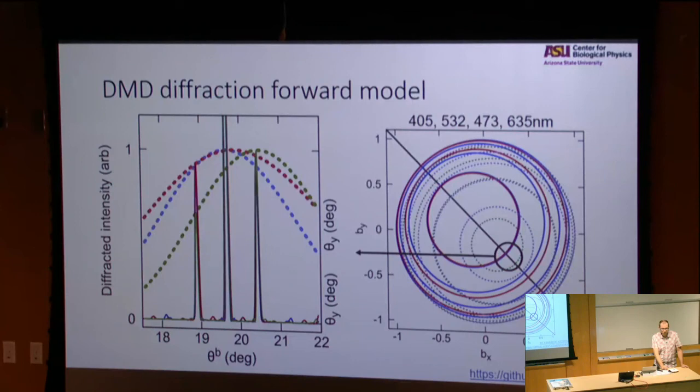The problem with the light sheet in terms of building a 3D volume is you need to sweep the whole thing before you can build a 3D volume, right? Whereas if you did light field microscopy or point spread function manipulation, you actually get that whole 3D volume at once. So theoretically, your volumetric rate is higher for these methods that don't require you to sweep.